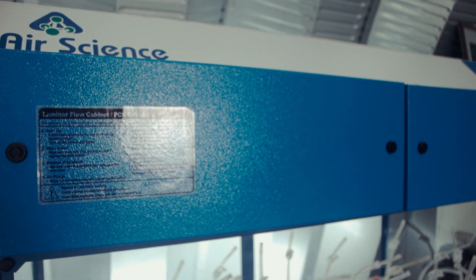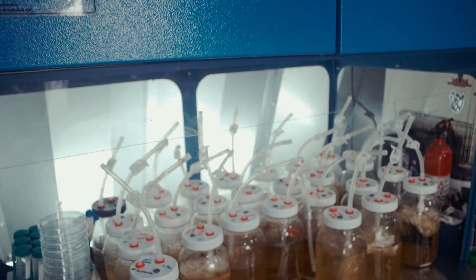Before you even think about working with liquid cultures, you're going to want to consider getting a flow hood. One of the biggest caveats of working with liquid cultures is that they're very easy to contaminate and they're very difficult to detect contamination until it's further down the line. A flow hood is going to provide a lot of protection for your cultures and it's going to increase your success dramatically enough to make it worth it. If you don't have a flow hood, you might be able to get away with a still air box, but you're looking at a 40 to 50% success rate compared to a 90-plus percent rate, and when you're farming, having that success is extremely important.